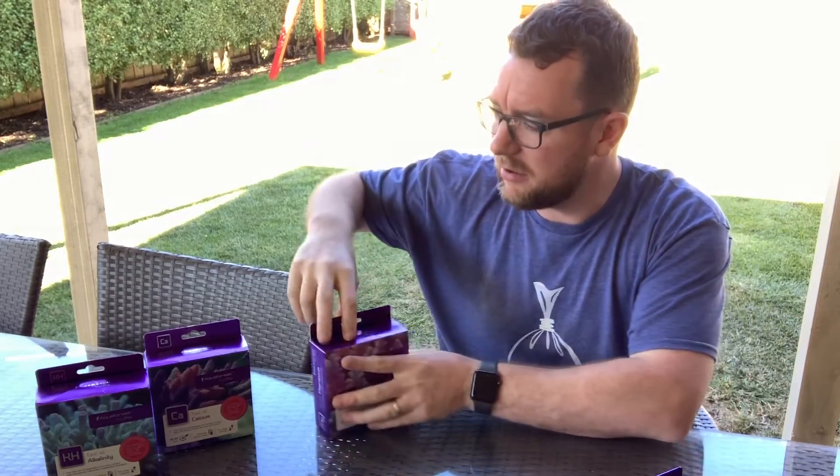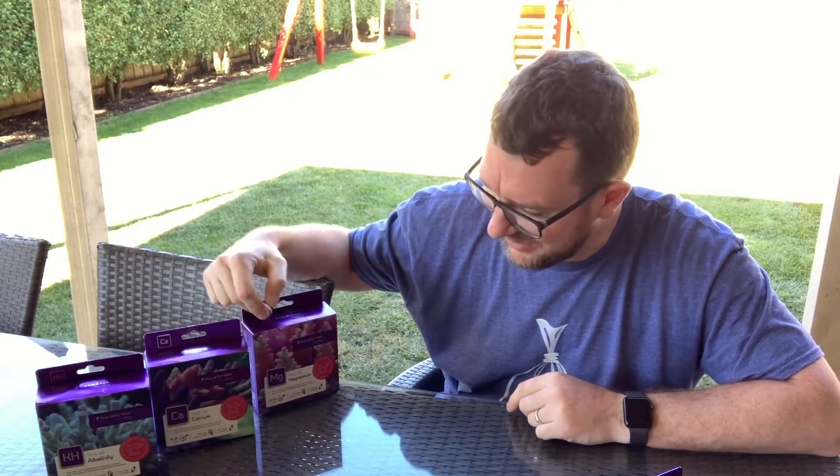As you know, Aquaforest have had a few test kits out for a while now. I've used their magnesium, calcium, and alkalinity kits for a little while.